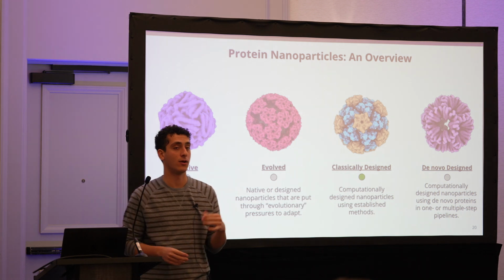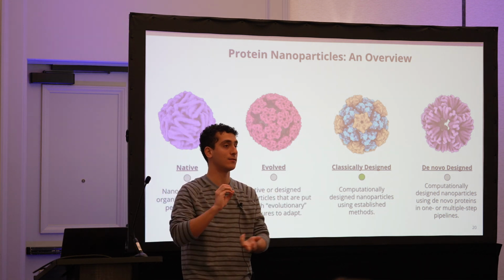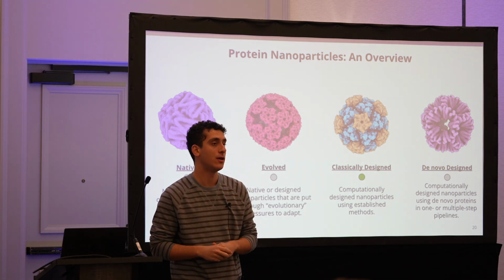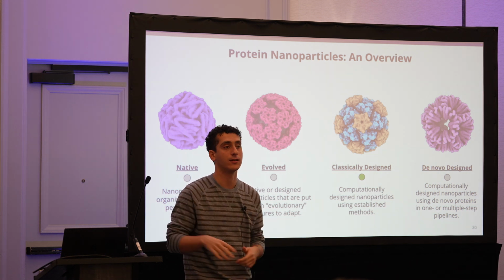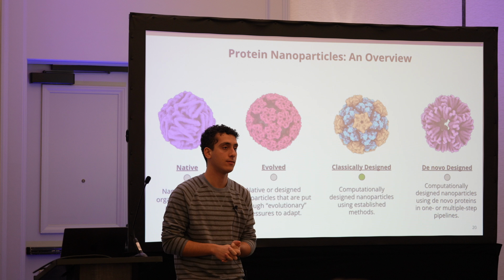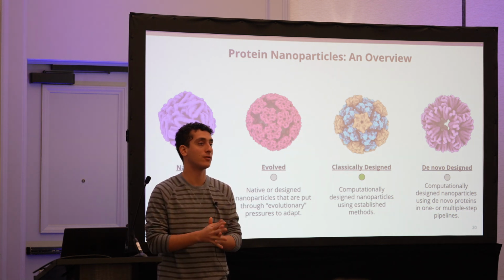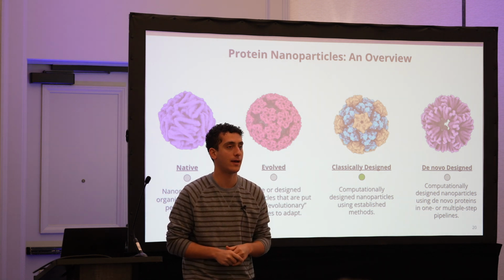There are also nanoparticles that will form half, or they're missing pieces from the nanoparticle. So there's definitely variation, but the most robust ones tend to have very minimal aggregation and component peaks, and then they have mostly your nanoparticle peak. So we can design them pretty monodisperse, but it does happen where there are other pieces to that.